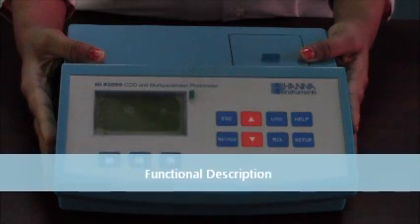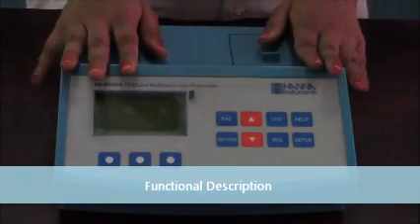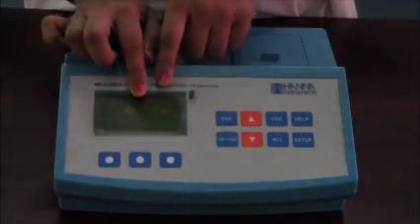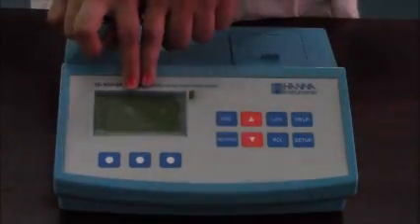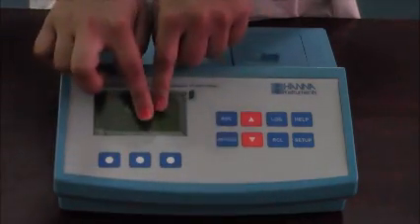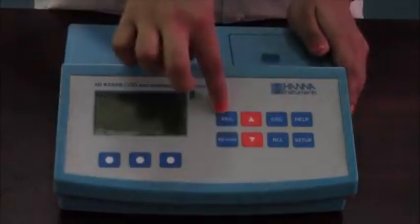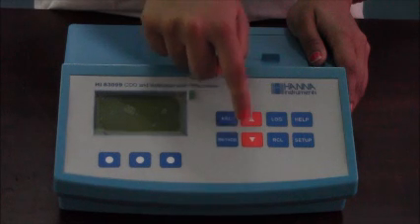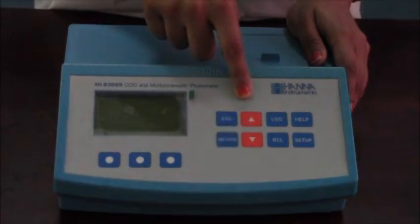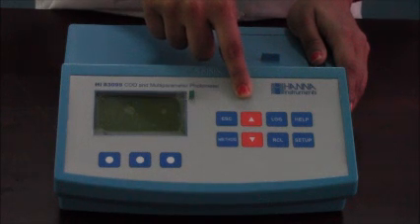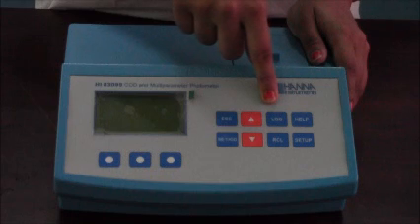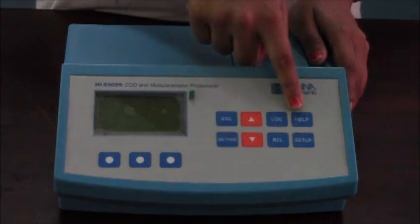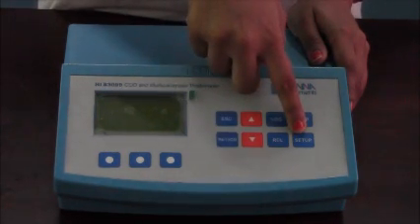Let us now see the functional description of HI83099. On the top panel of the meter is the sample holder with cuvette lid. On the front panel of the meter is the LCD display screen and waterproof keypad. Below the LCD display screen are the operational keys to perform functions displayed on the LCD. The Escape key is to exit the current screen. The Method key is to select the method menu. Up and down arrow keys are used to navigate between menus or to increase or decrease a set value or go to a second-level function. The Log key is to send the current reading. The RCL key is used to recall the previous reading. The Help key will enter the help menu and the Setup key will enter the setup menu.